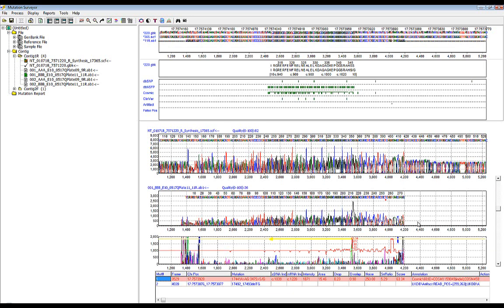In contrast, false positive entries are stored relative to mutation call and chromosome position, and are not dependent on the read position.